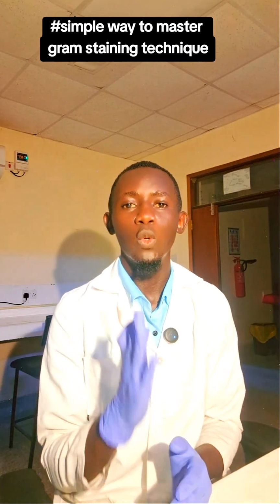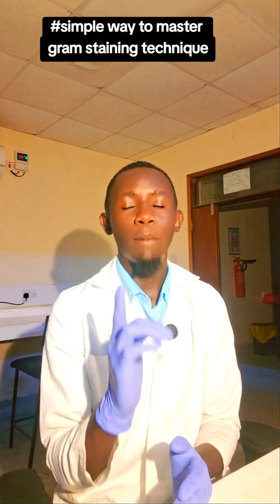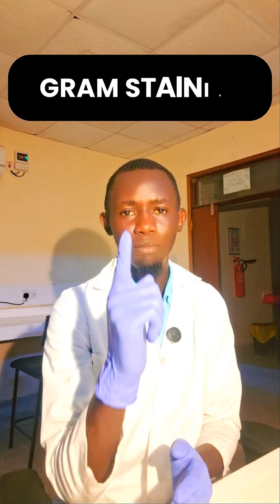gonna discuss with you a very crucial stain that is used in the laboratory. I'm talking about gram staining.